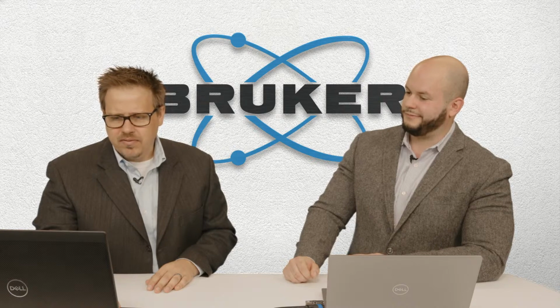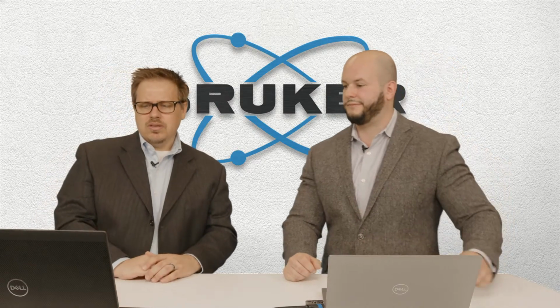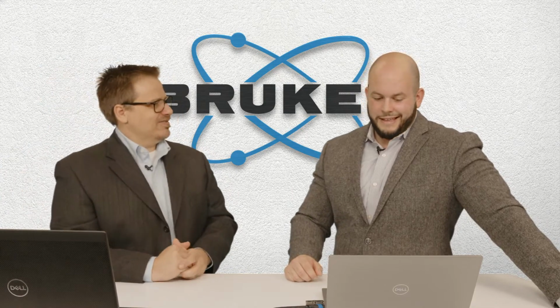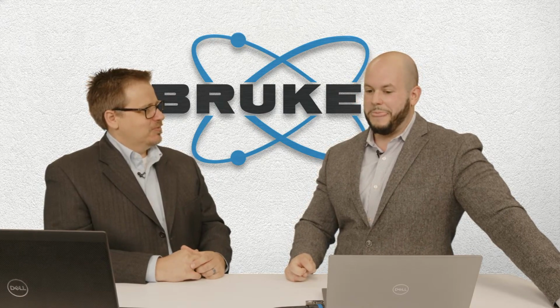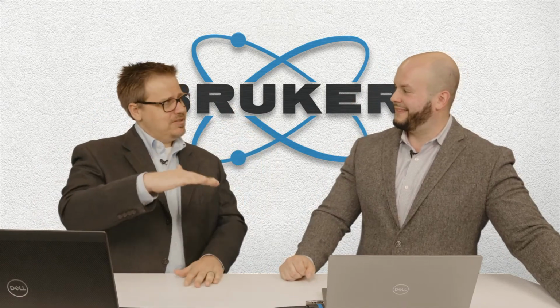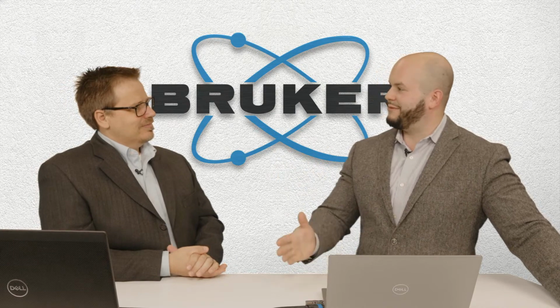Now, we do have another question that had come in, from Elizabeth. Do I need any special parts on my machine to do this? Well, you need your standard X-ray diffractometer. We have an X-ray tube, we have a detector. Yep. What about the stage? The stage has to be able to manipulate the sample in space, though. That's kind of the main thing, right?